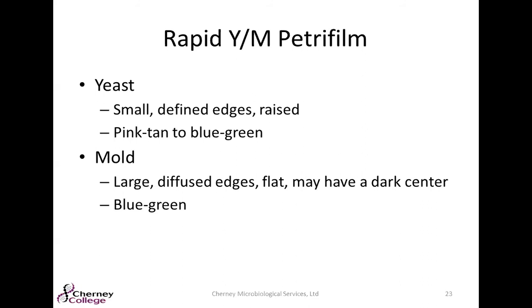And as far as mold, they're large, diffused edges, flat. They may have a dark center or a foci. They appear very filamentous. They look like a mold trapped underneath the Petrifilm. They're typically blue-green in color.